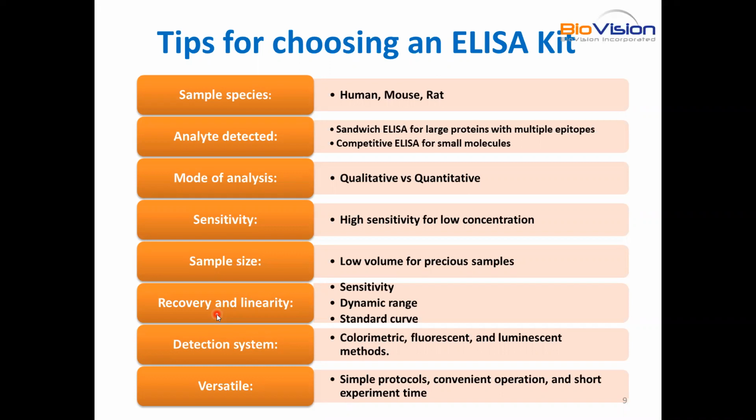While the linearity of dilution determines the extent to which the dose response, meaning the different dilutions of the target protein, is linear in a particular diluent. That means the different dilutions of the protein of interest, or the analyte, should show the same recovery, or the same concentration for all the dilutions. So ideally, the concentration or recovery of the sample should be similar for all dilutions.